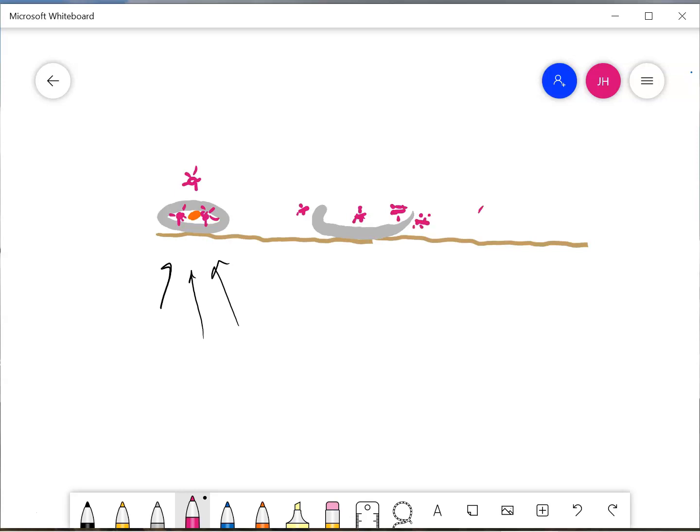So the little virions will get out. So they basically kill the cell and they get out. So you have to grow a host cell on the agar surface, and it's kind of like that. You grow host cells on the agar surface, and then if they get infected by the virus, they will break open and die. So how do we use this?